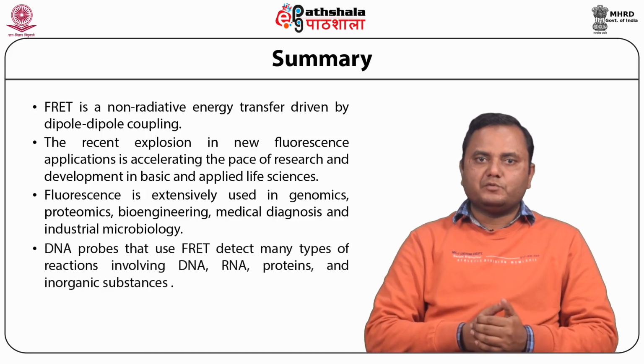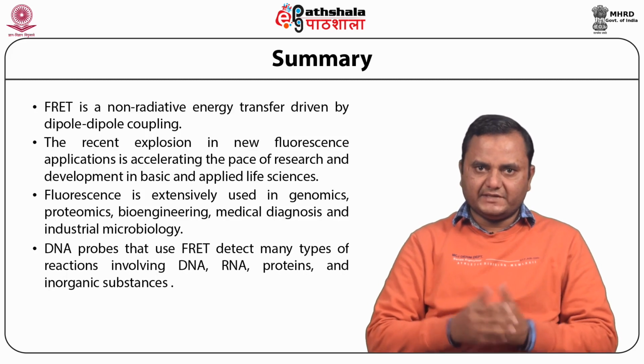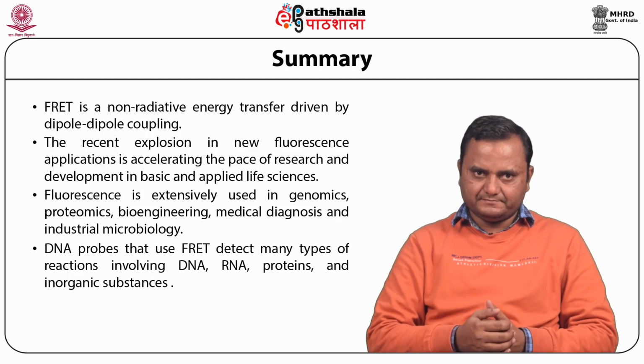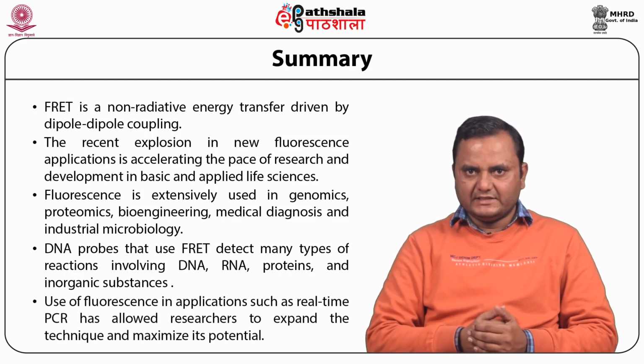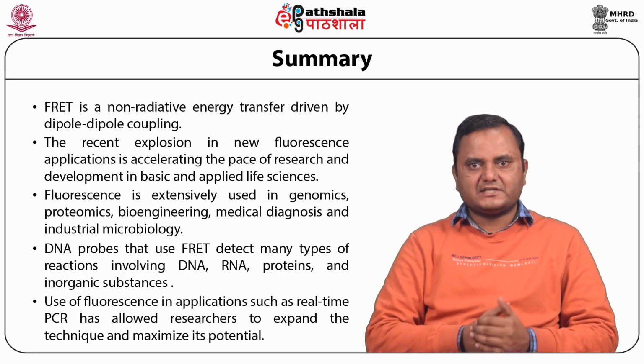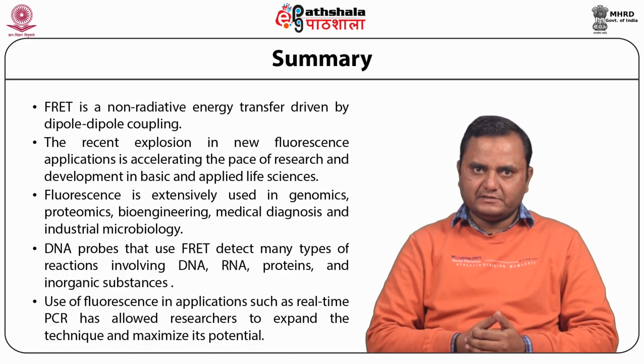DNA probes that use FRET detect many types of reactions involving DNA, RNA, protein, and inorganic substances. Use of fluorescence in applications such as real-time PCR has allowed researchers to expand the techniques and maximize their potential.